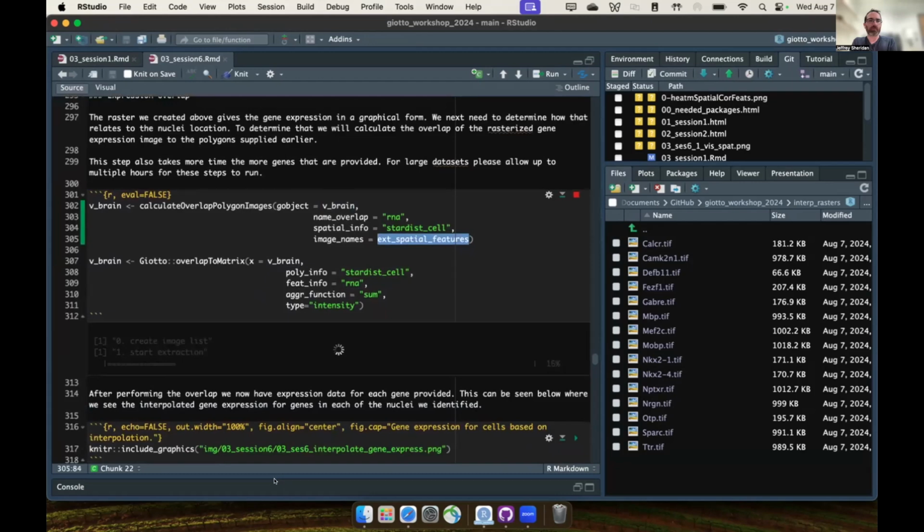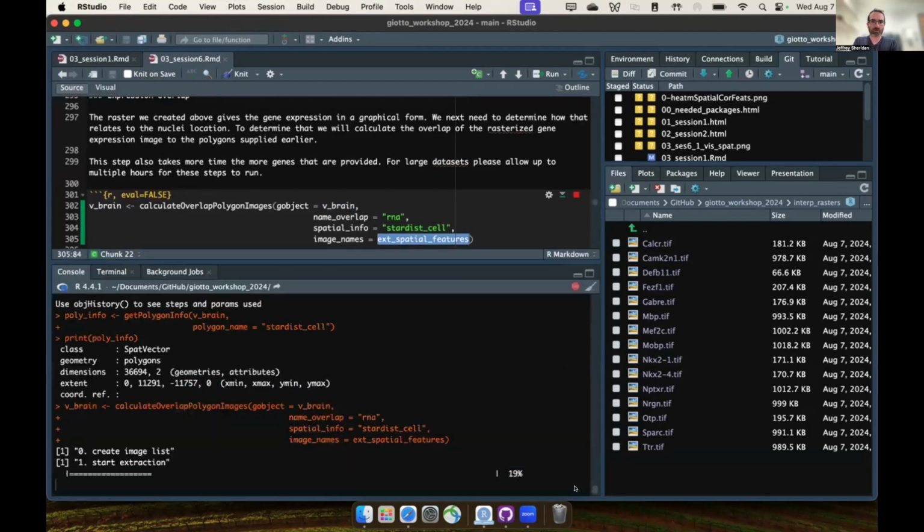So again, where are we at? If I could, yeah, that's cool.